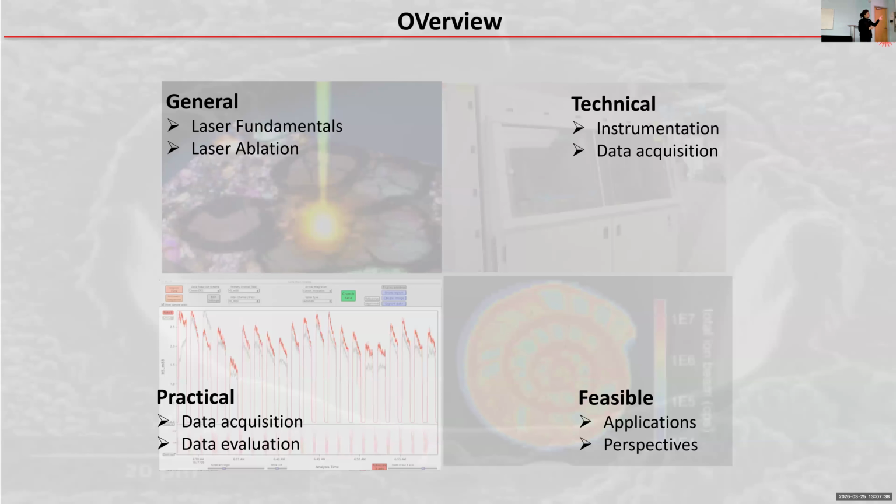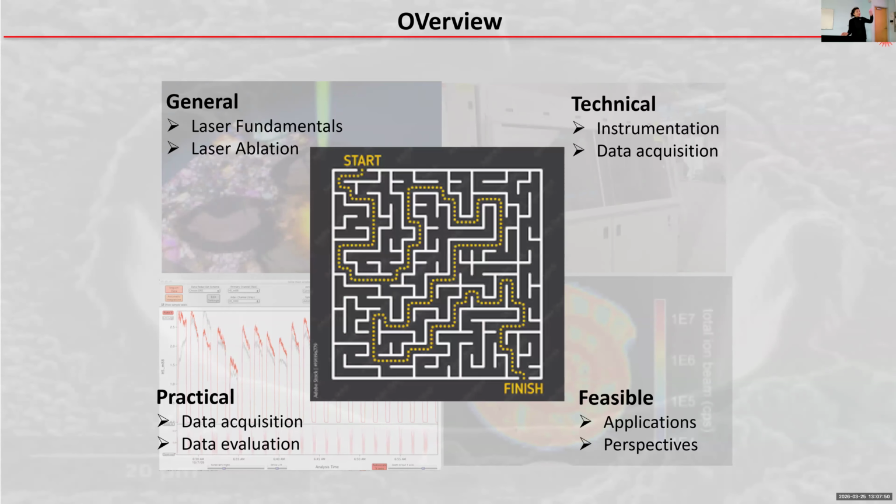So the technique, I tried very hard, and I would really not say I'm an expert in it, so I am just scratching all these areas. However, laser ICP-MS, and this is what I always say, never wants to work for you, it wants to work with you. Each one of these aspects is interrelated, and it's very hard to strictly follow a procedure, which the laser doesn't follow once you want to set up a method. So there will be a lot of back and forth, but I will try to start with the general aspects and then leave you with some application notes as much as I can. But please bear with me, it will be a lot of scattering.